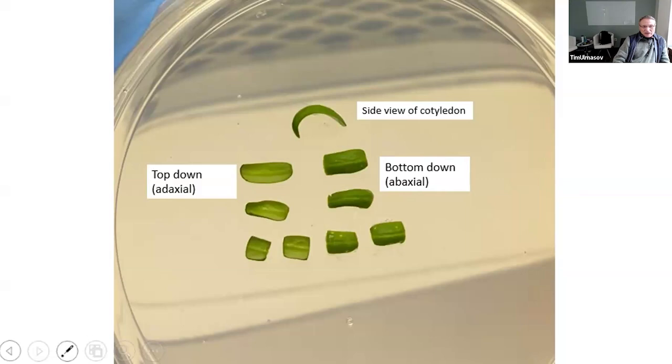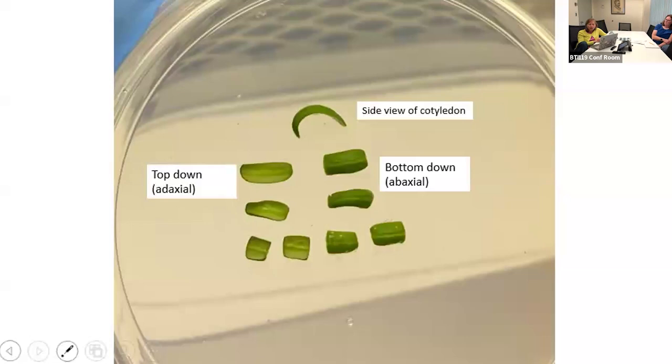Is there any evidence that it worked in tomato? There is a paper in Nicotiana benthamiana from Dan Voytas's group, where I think they do overexpression in tomato and show a method, but it's in the supplementary. I also know there's work in progress that I can't share information about, but it looks promising.